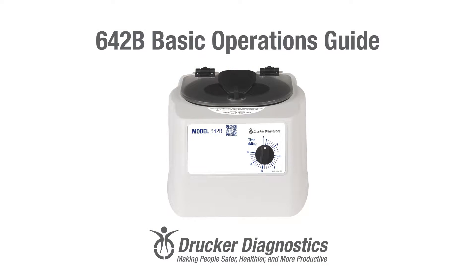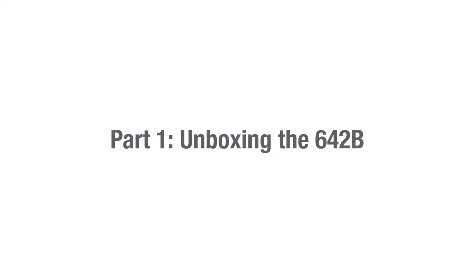Hi, I'm Dawn with Drucker Diagnostics, and today we're going to review the basic operations of your 642B centrifuge. If you're looking for something specific, take a look at the bottom of your screen. This video is divided into chapters so you can easily find what you need. 642B Basic Operations Guide. Part 1: Unboxing the 642B.